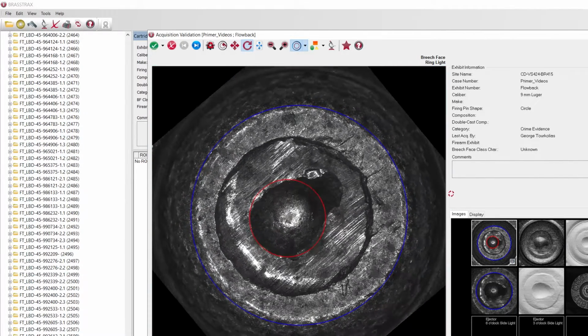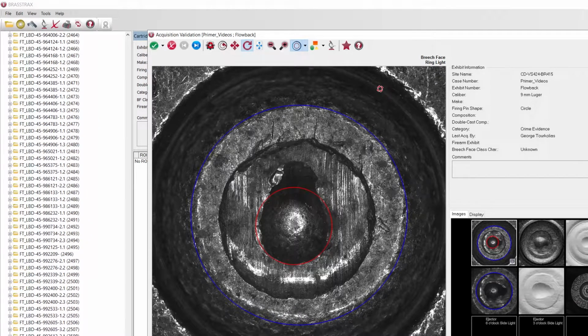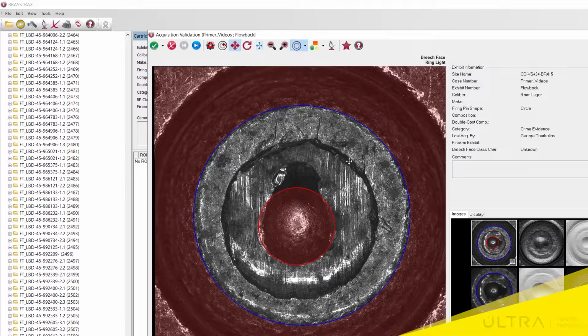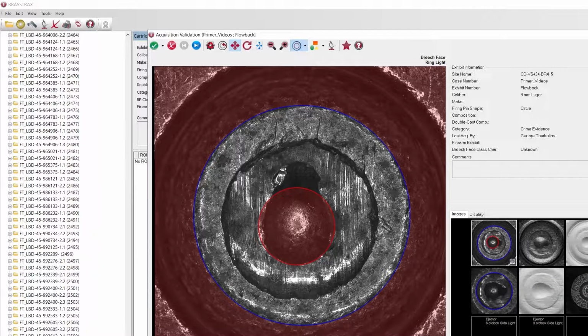And so the other area that occurs when you have a cartridge that was fired through a recoil action firearm is just like we see with that drag mark that we have here now. When you have a recoil action pistol, that drag mark happens because the firing pin nose is still sticking out as the chamber drops during the firing sequence. And when the flowback is flowed into that firing pin hole, when that drop occurs as well, you get a striated pattern left across the surface of that flowback, which is another area that can be of use.